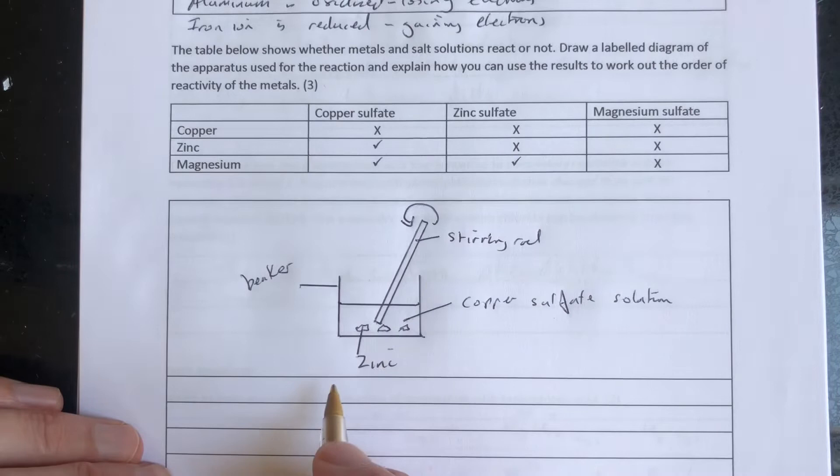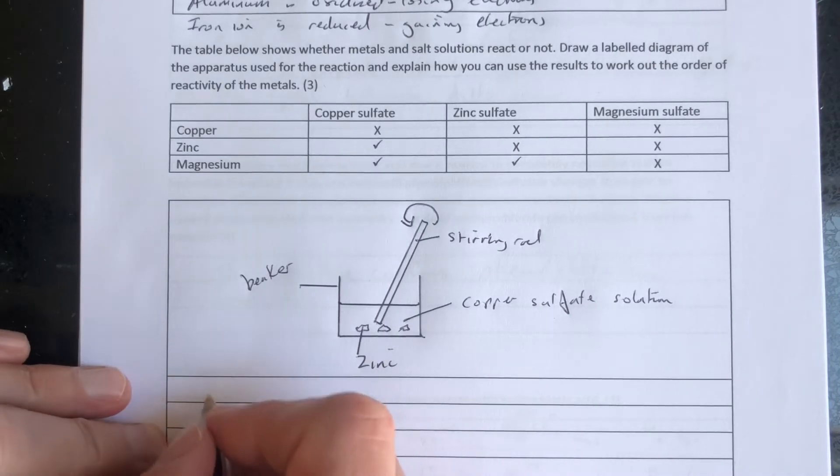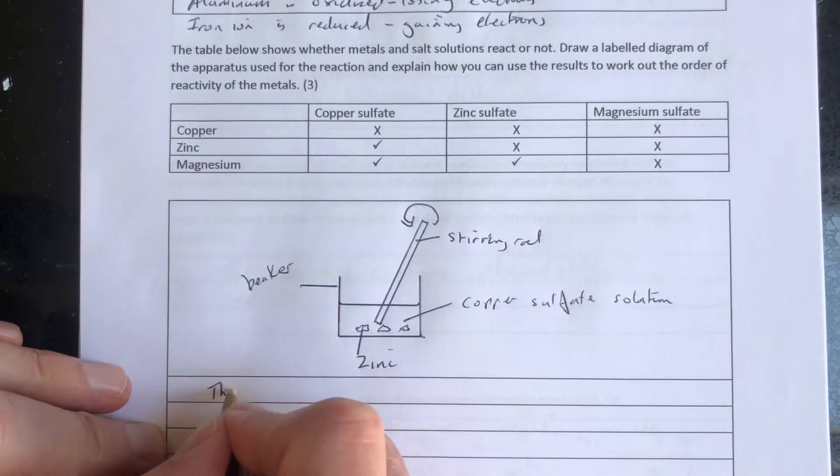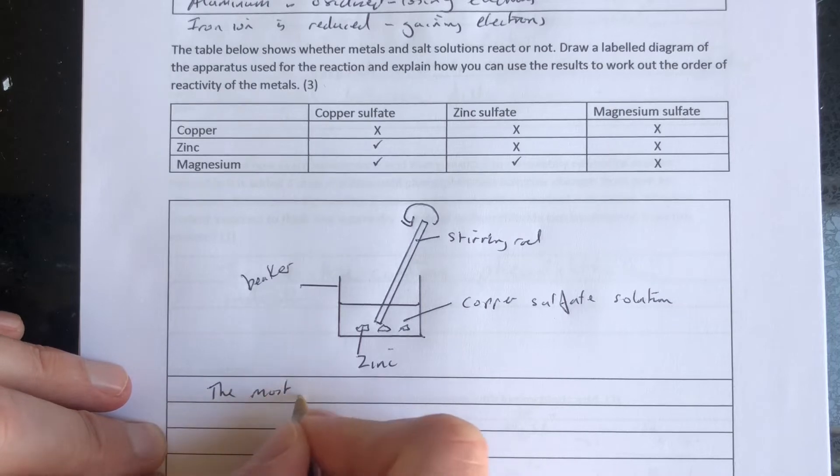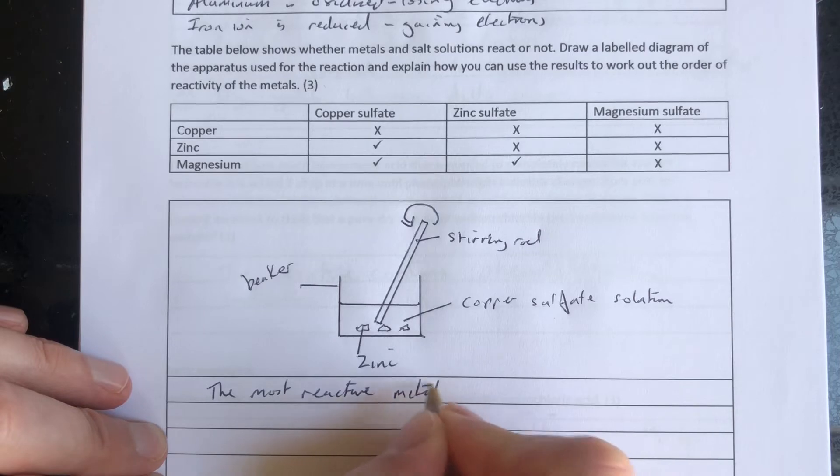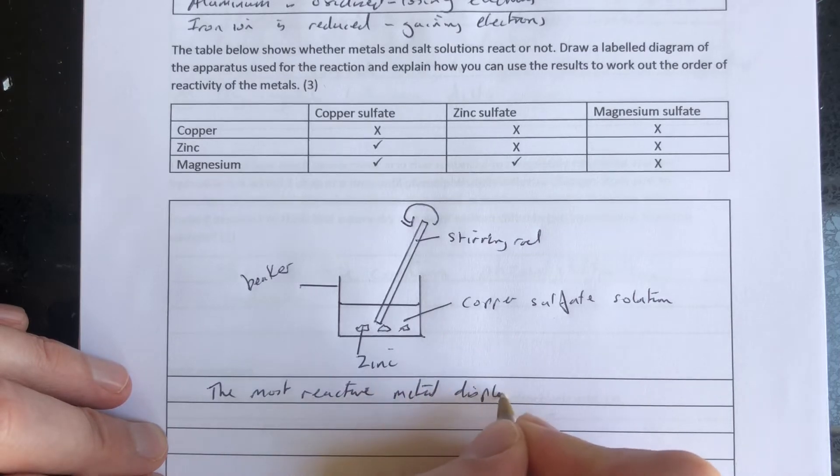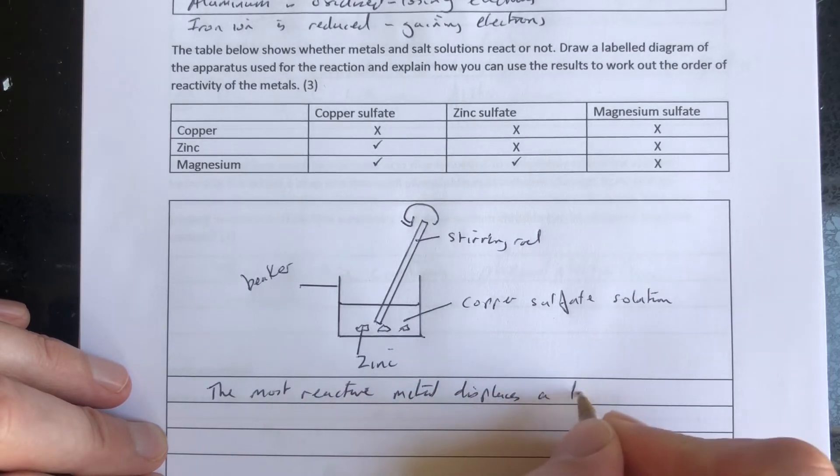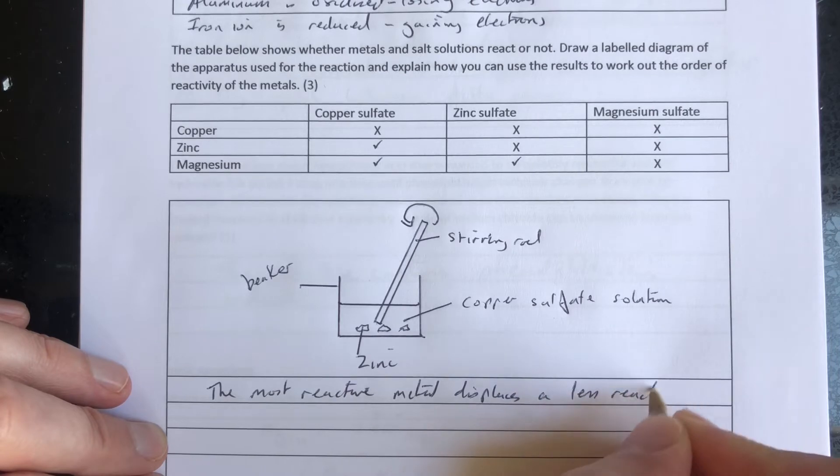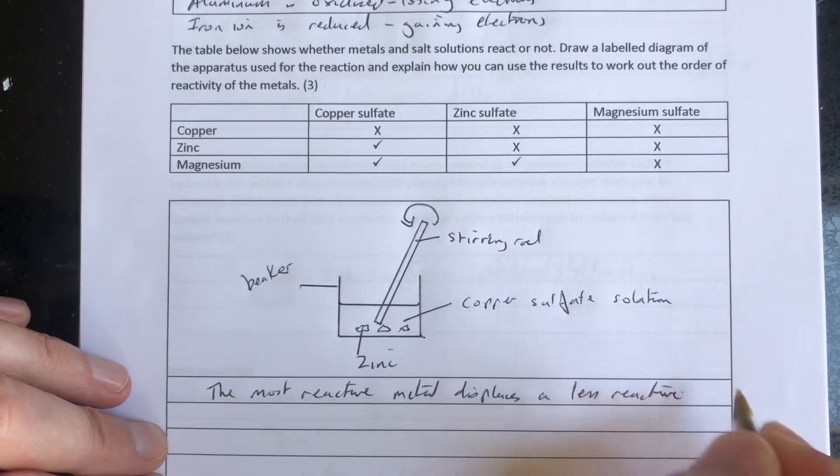So there's our apparatus. The rule is: the most reactive metal displaces a less reactive metal.